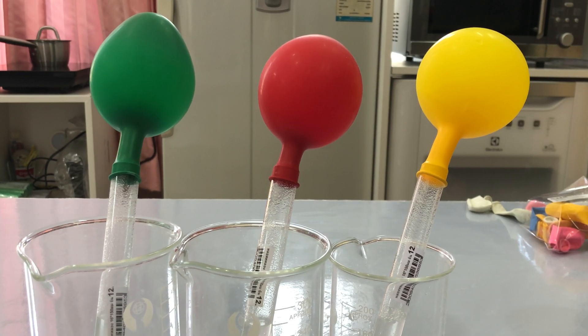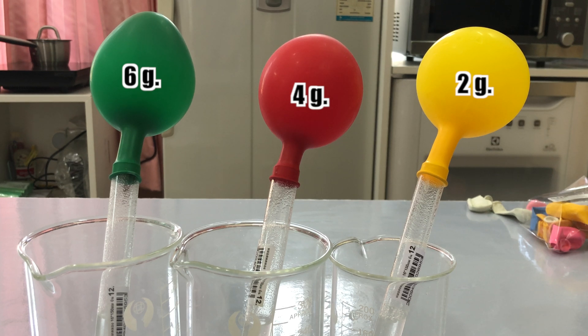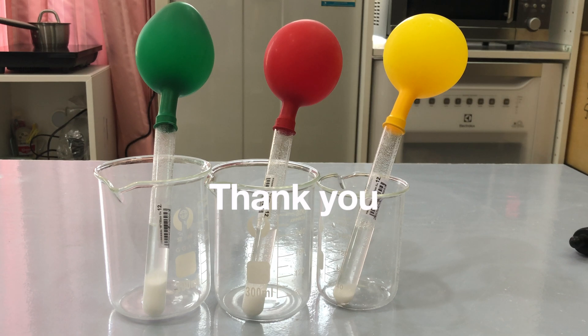So this is the result of this experiment. This is why it's so professional. Now we're done, you can find the weights.